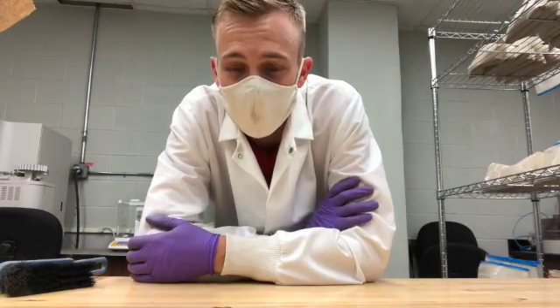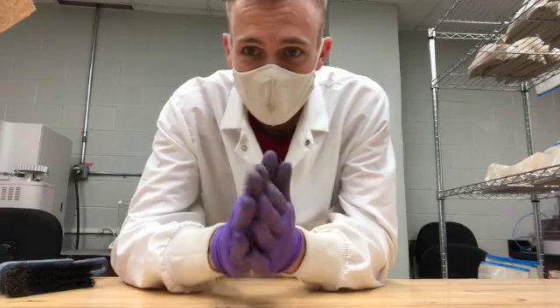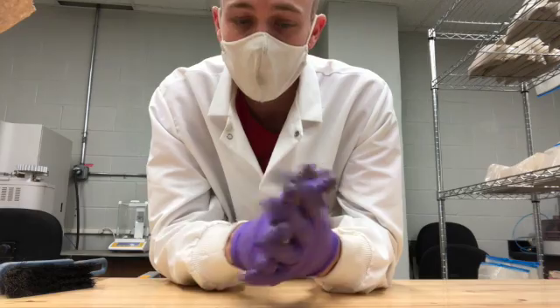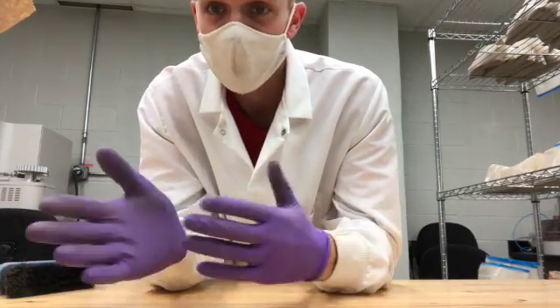Welcome to In the Lab with Sheldon. Today I've been working on some bulk density samples, and when you're dealing with bulk density you just want to see how compacted or not compacted your soil is.